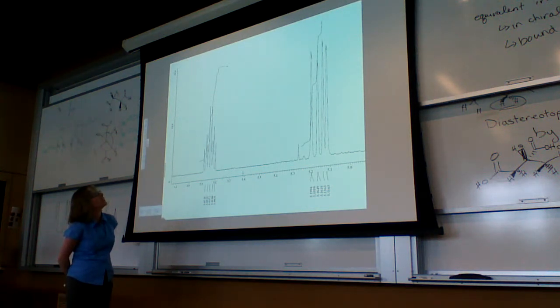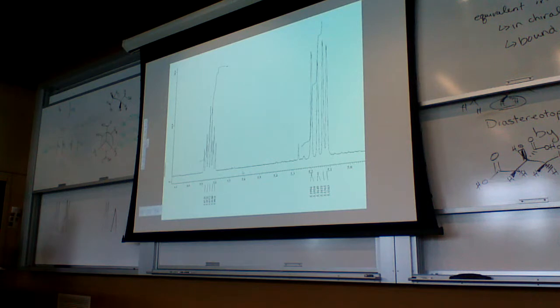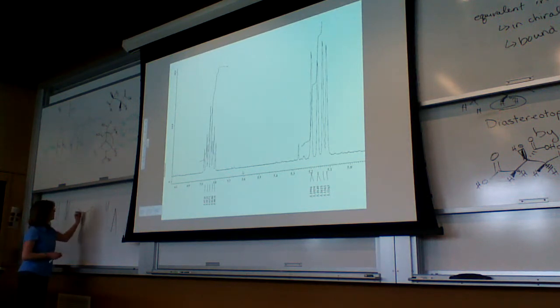Just trying to decide where to start. Let's start with the hard one. The one hydrogen here is going to be the more complicated one. It looks like this is going to be our CH group that's in the middle. So it's probably going to be that.